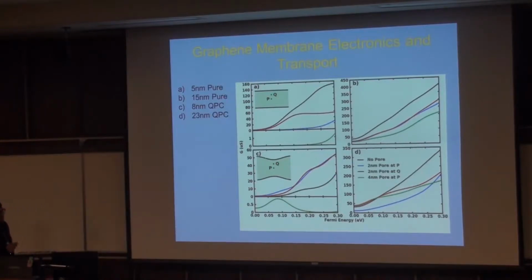So why is this important? Well, the Fermi energy, like I said, is a function of the voltage of the backgate. But in addition to that, it's a function of the electrostatic potential of the entire environment. So if a DNA molecule is being passed through this nanoribbon, perhaps the molecules of the DNA can change the Fermi energy locally around the nanopore and manipulate the current within the nanopore.